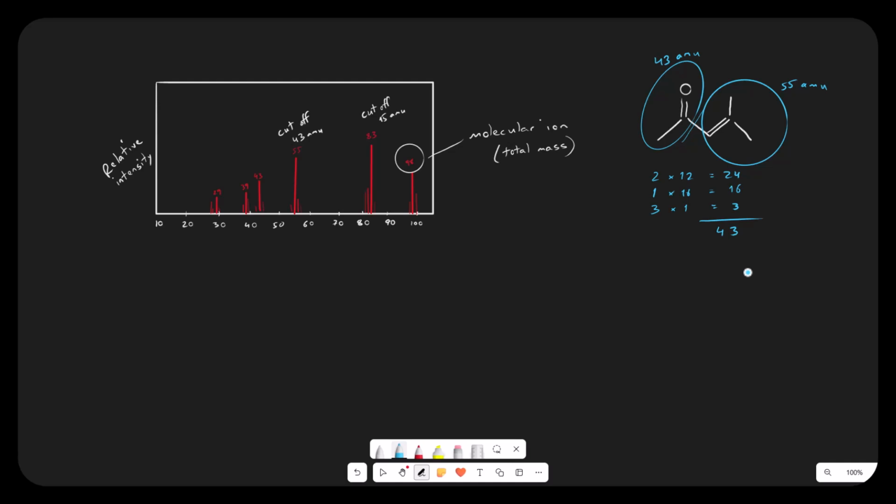In an unknown situation where maybe I'm testing some kind of a vial from a crime scene or something, this on its own is probably not going to give me an answer. But once I start putting some different tests together, this can be a really good confirmation tactic.